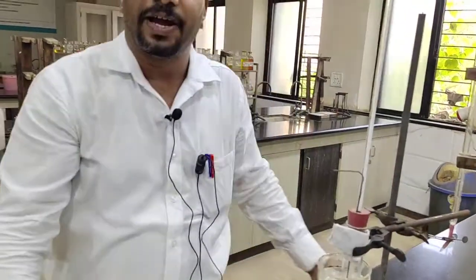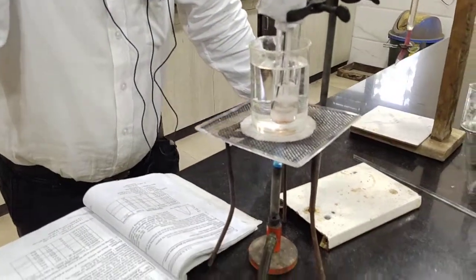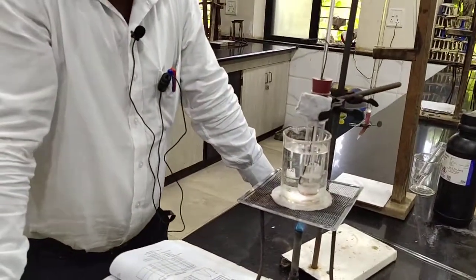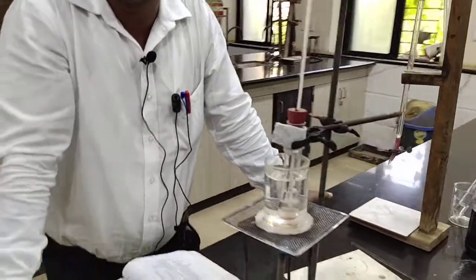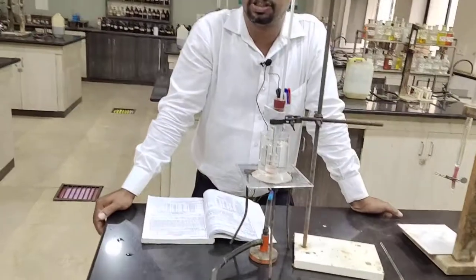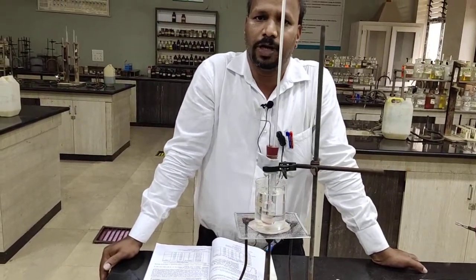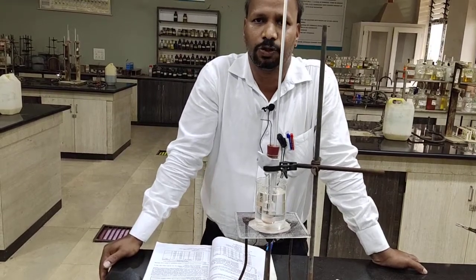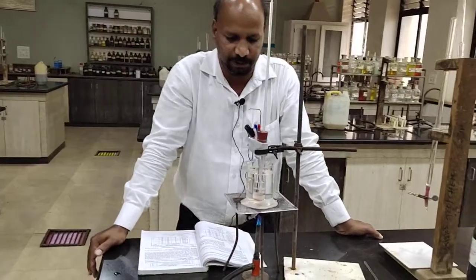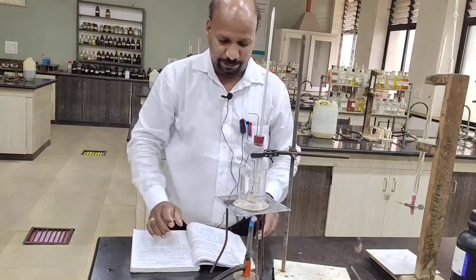The critical solution temperature is the temperature above which all proportions of component A and B, that is, the percentage of phenol and the percentage of water, are completely miscible. That temperature we have to find out, and it is known as the critical solution temperature for the phenol water system. Now let us see the experiment part.